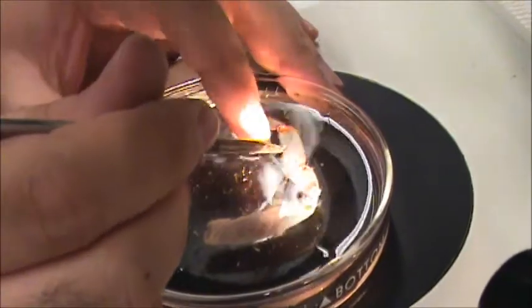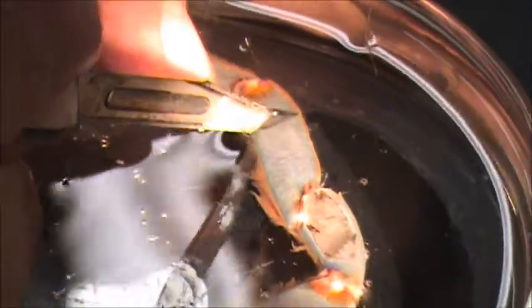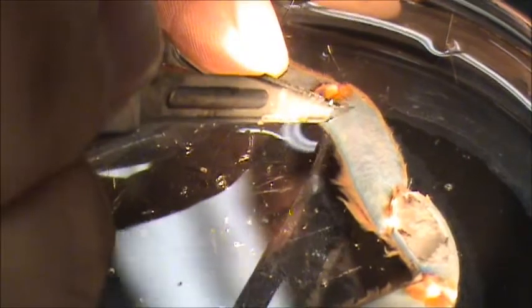Then now I'm going to dissect the propodite segment. Like I said, the opener muscle is located at the dorsal region and the closer muscle is located at the ventral region. Then the tension nerve is located close to the opener muscle. Then we have to make a window here like this, then remove the cuticle, then after that remove the closer muscle. Then we can see the tension nerve very easily.